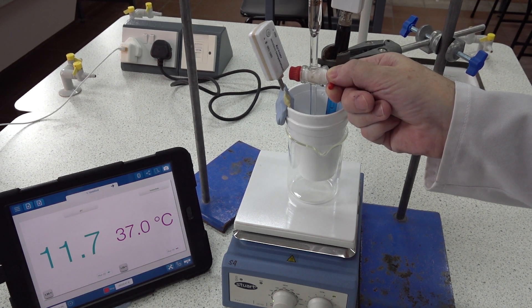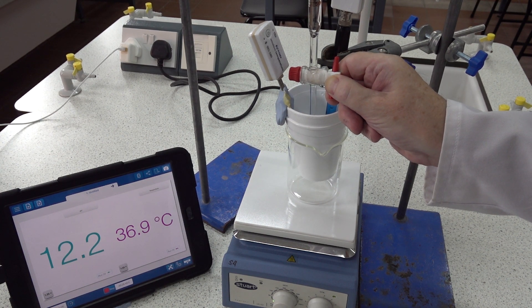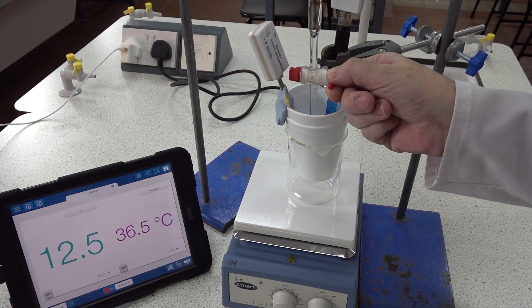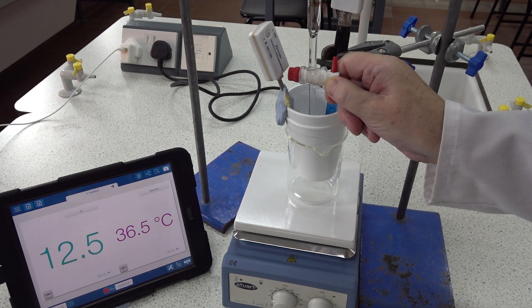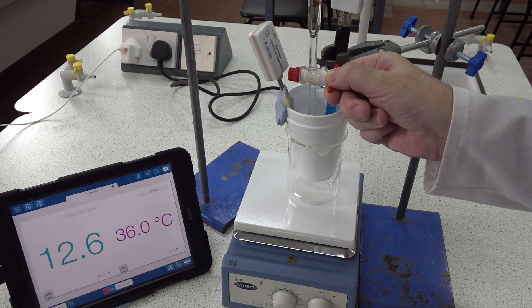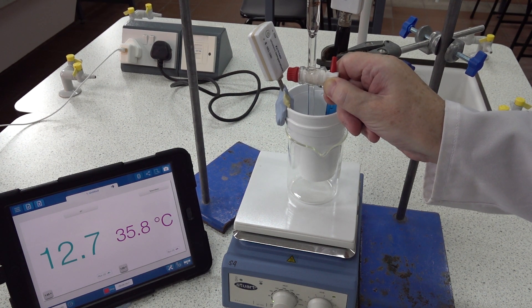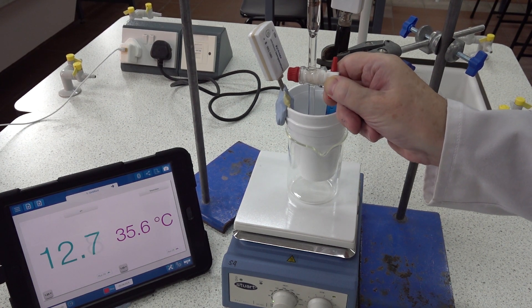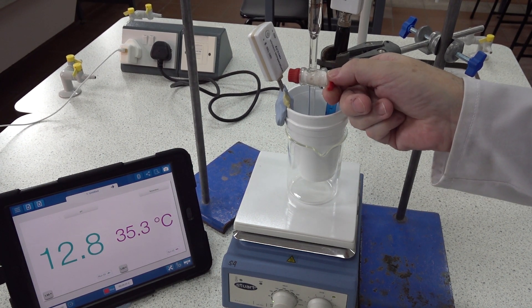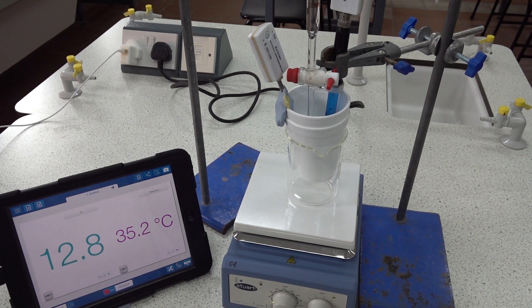Twenty-seven. Twenty-eight. Twenty-nine. Thirty. Thirty-one. Thirty-two. Thirty-three. Thirty-five. Thirty-six. That's the end of our data accumulation. Thirty-seven. Thirty-eight. Thirty-nine. Forty centimeters cubed.